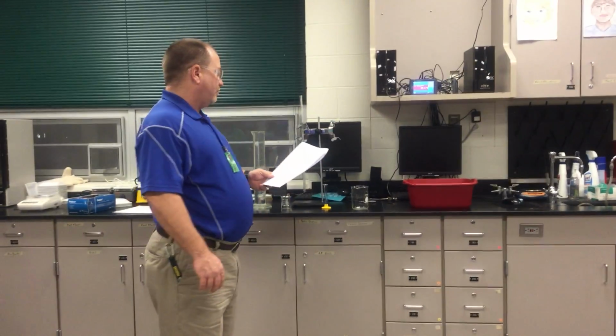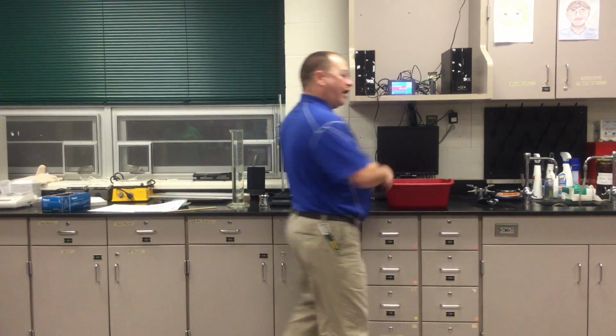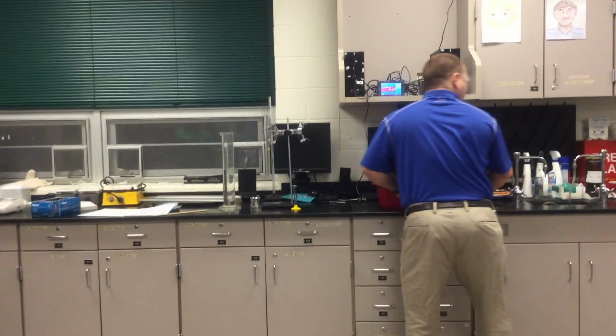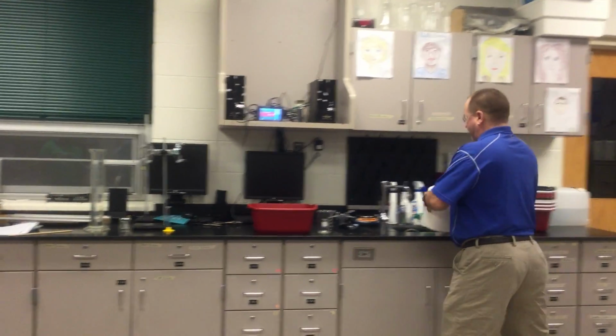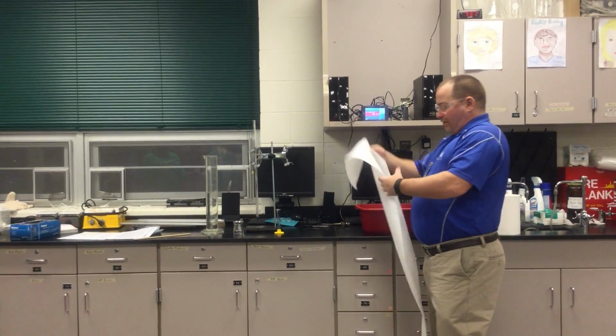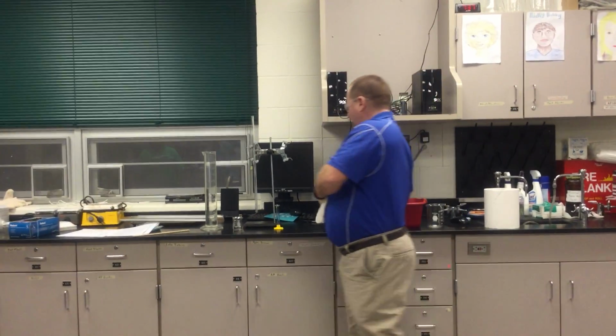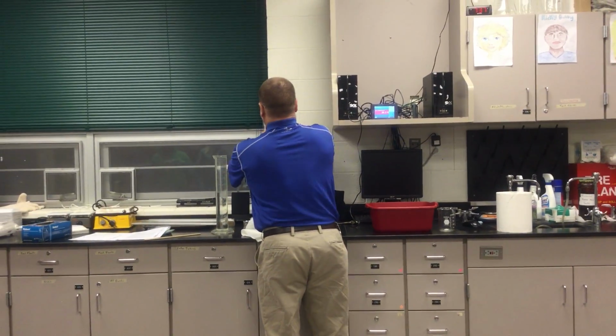Fill a 400 or a 600 milliliter beaker 2/3 full of water. So all I'm going to do, I'm going to get my paper towel, because this will be a little bit wet over here. I'm going to fold it up just to try to keep water from going everywhere. Okay, it shouldn't be terribly bad.